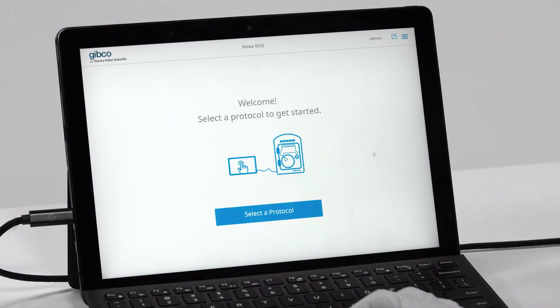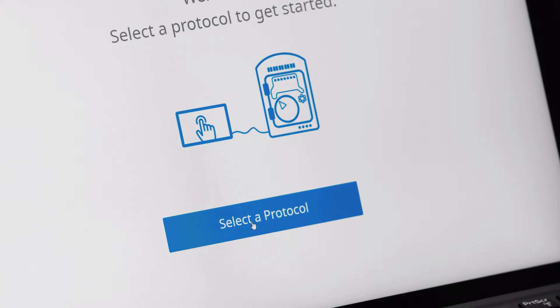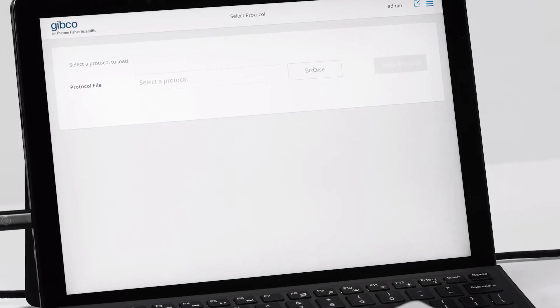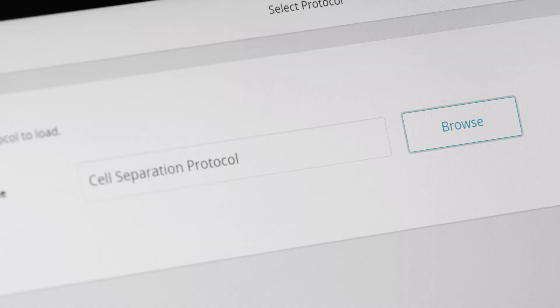Second, navigate to a preset protocol, click select a protocol, and then browse to find your protocol. Here, that'll be cell separation.